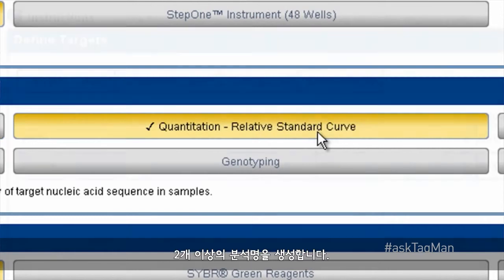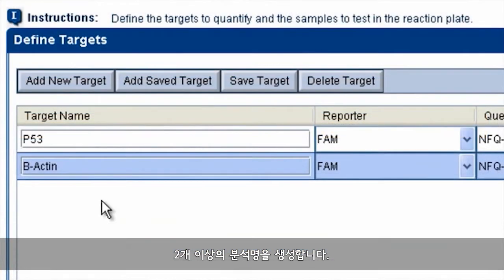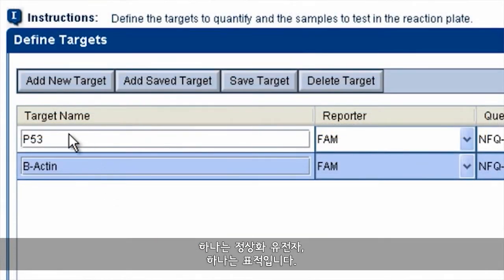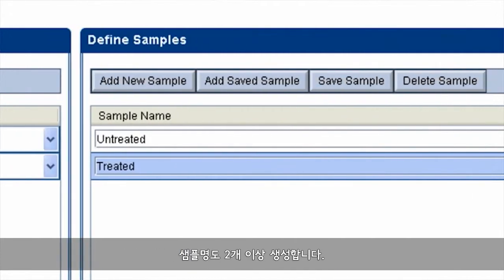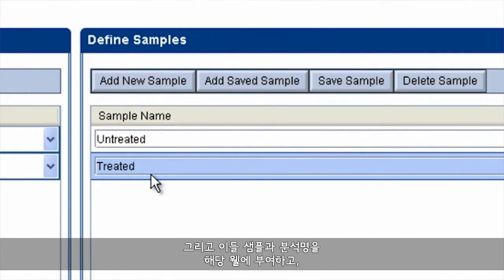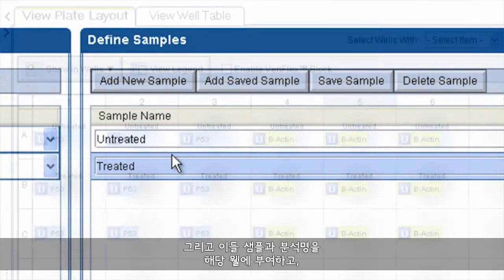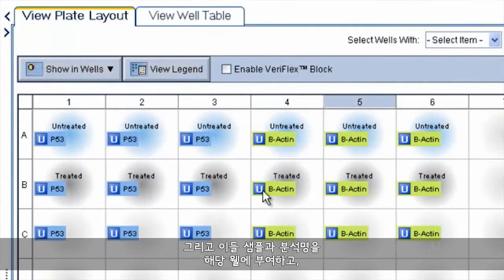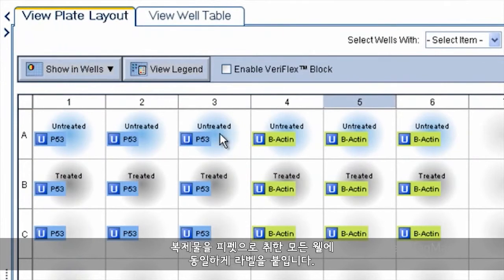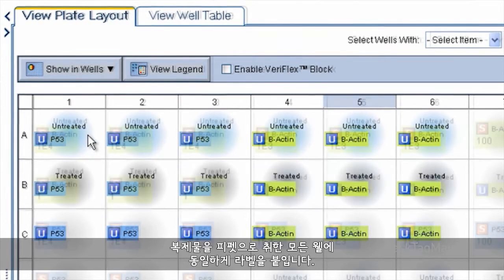You'll need to create at least two assay names — one normalizer and one target — and at least two sample names. You'll then assign these sample and assay names to the appropriate wells, making certain to identically label any wells representing pipetting replicates.